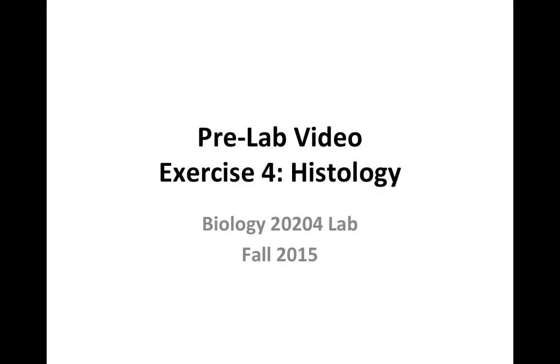In this video, we will be describing the histology that you will view during exercise 4. Please watch this pre-lab video before attending lab this week.